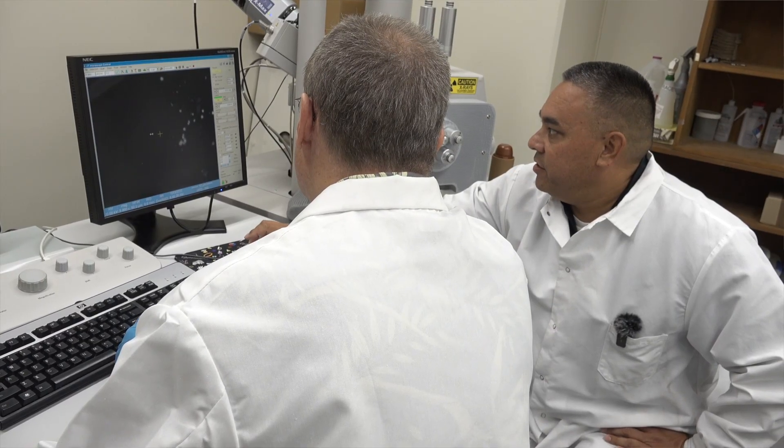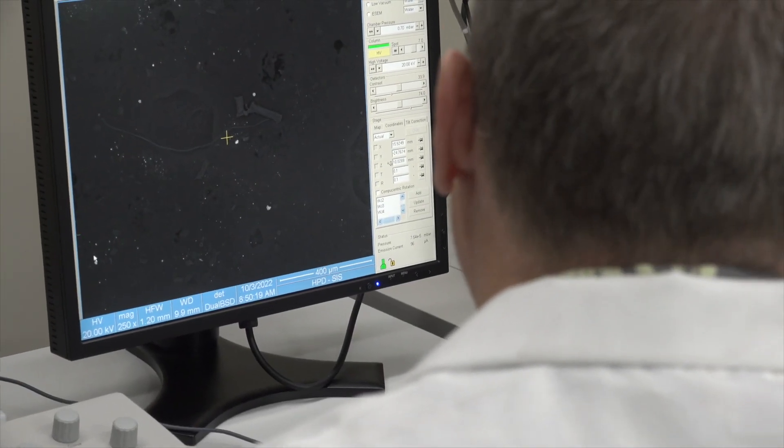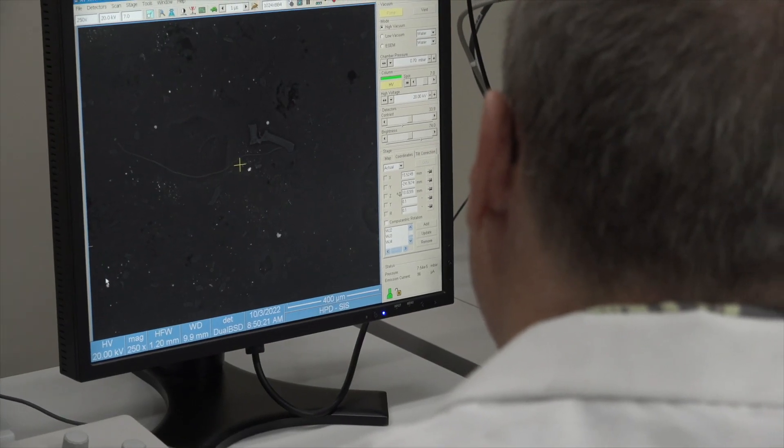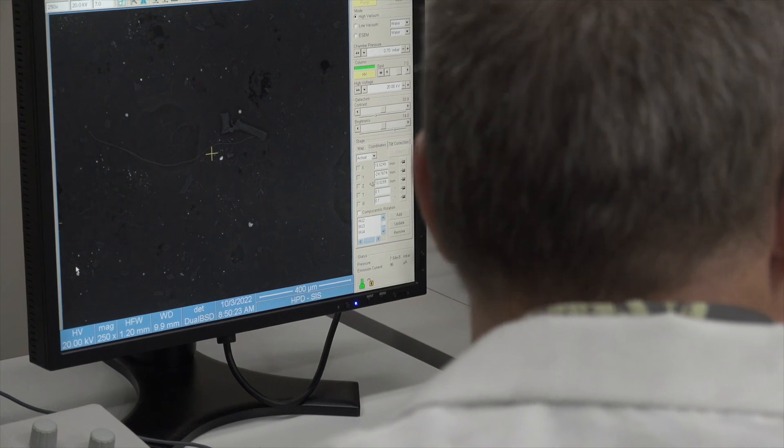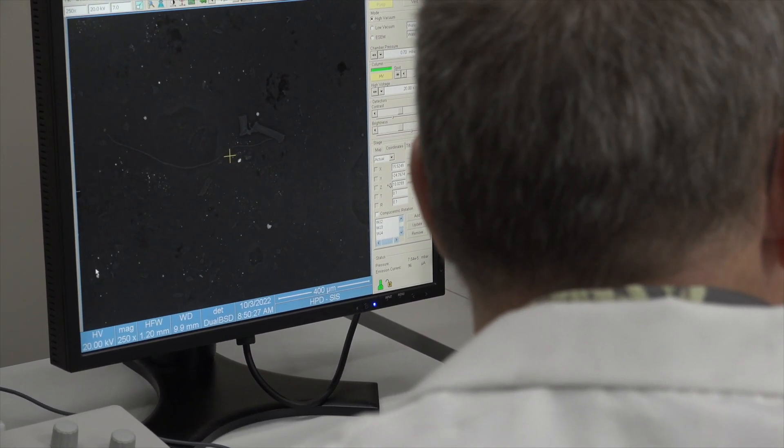What we're looking at is the surface of our sample. It's like stars in the sky. That's what it looks like. Actually, the brighter the particle, the more metallic it is. So it's telling us right now that we're seeing some particles that are metallic that could be gunshot residue.